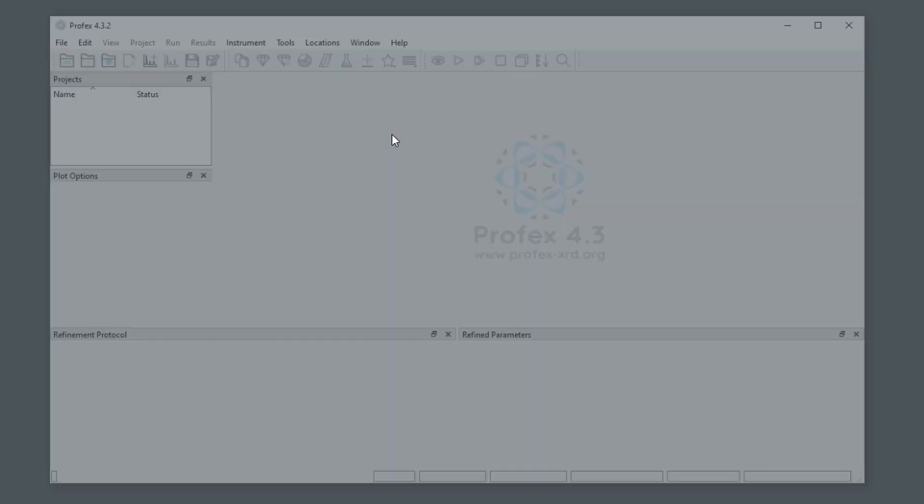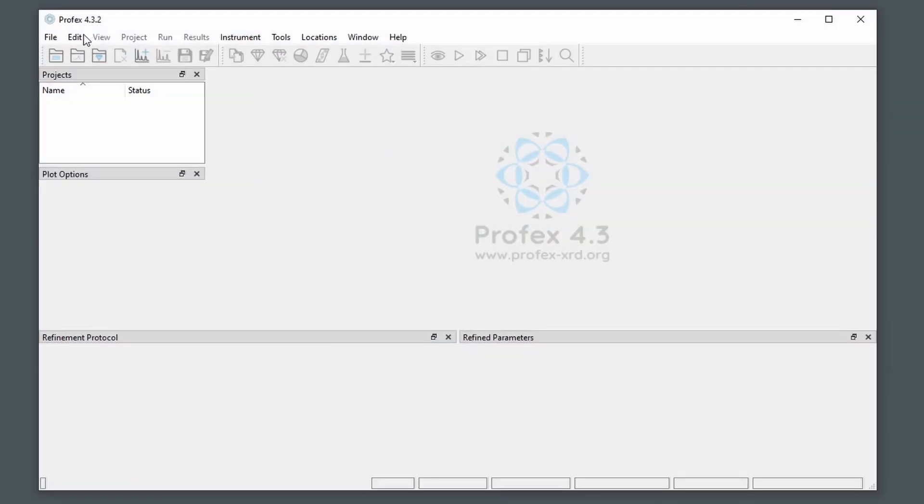And now if we start Profex, we have the new version 4.3.2.